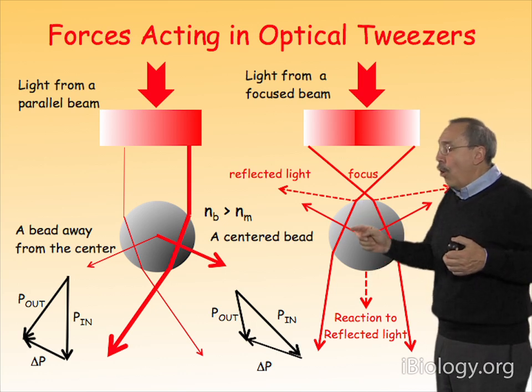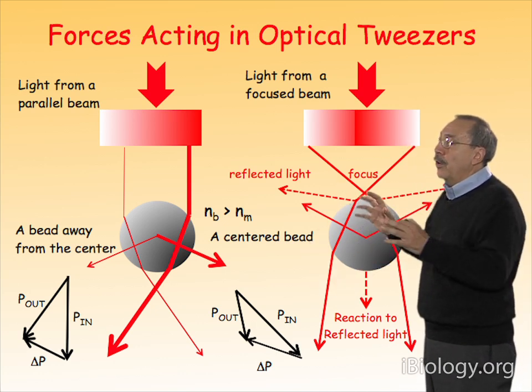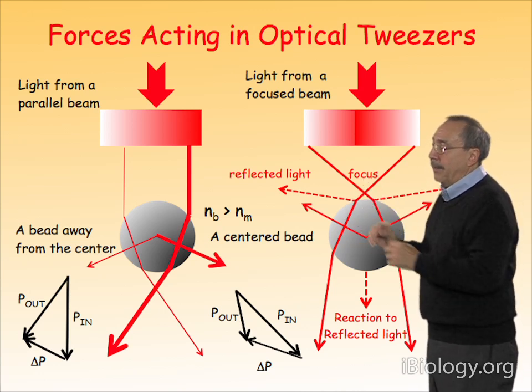So in the end, all these forces have to actually balance each other in order to produce a stable trapping of the object in the beam.